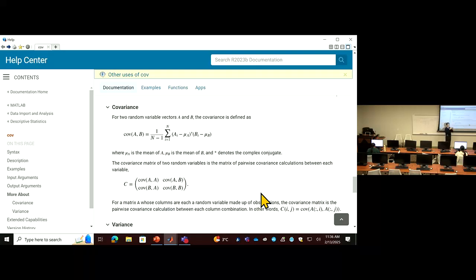And these two have to be the same number, so you have to sample the same gene in the two genes in the same cell. Okay, you cannot do one sample against another sample. You have a different number of cells. They are not measured in the same cell. You cannot do that. So this is within the matrix of the same data set.